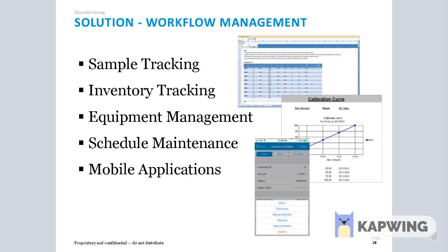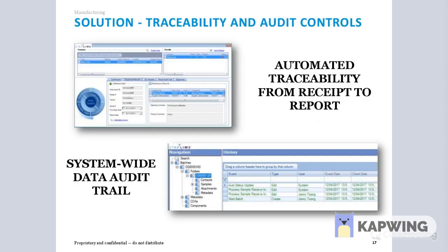Just expanding on the audit trail and traceability. Oops, sorry, go back. A compliant LIMS will allow for the full sample genealogy in a complete record, which will consist of several things, such as every analyst that worked on testing the samples, QC records, equipment calibration records, testing materials used, etc. Also results that include the specification for the result and the automatic logic that is applied during the testing.